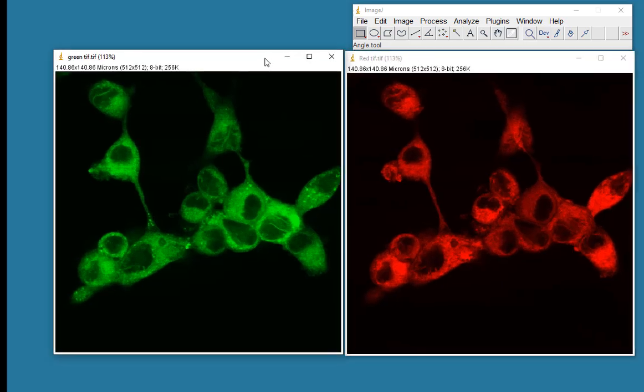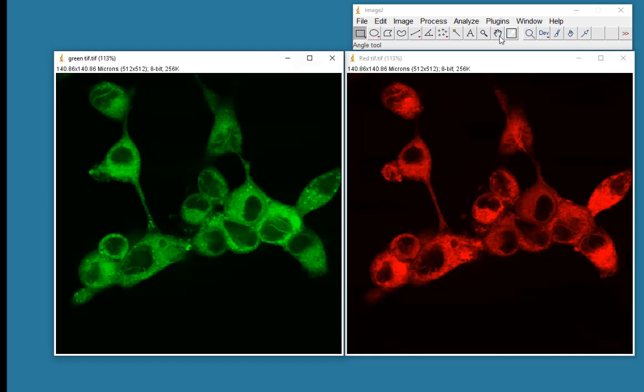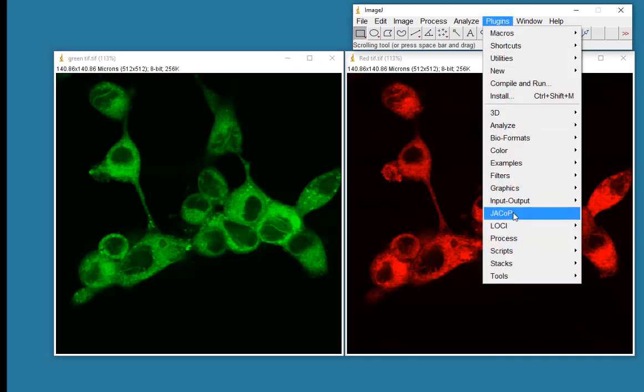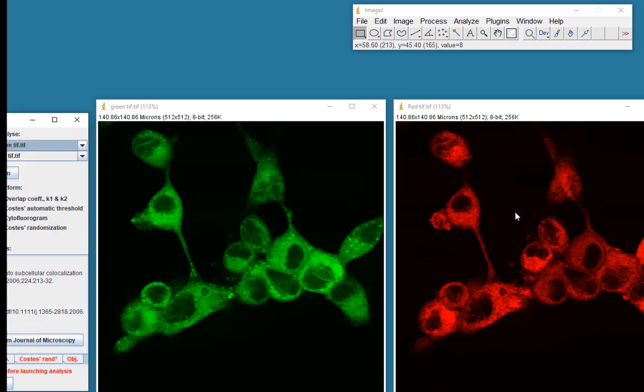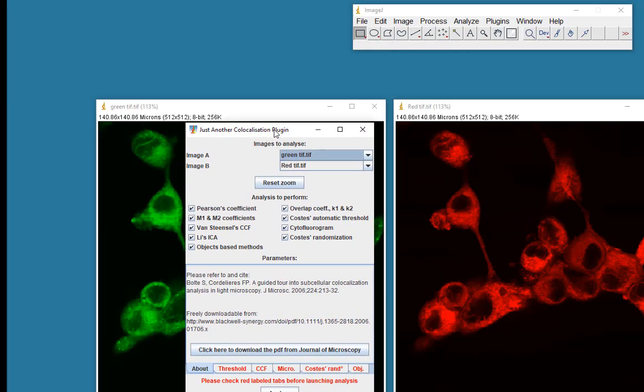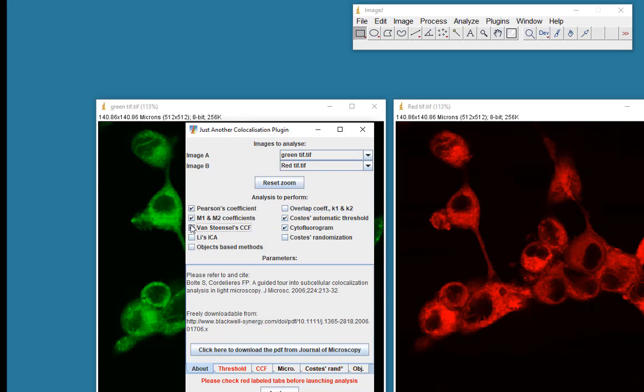What I'm going to use is a plug-in called JACoP, which stands for Just Another Colocalization Plug-in. I suppose the creators of the plug-in thought that was quite humorous. So here's the information that we need to give the JACoP. There's a lot of options here, and I'm really only going to choose the Costes' threshold, the cytofluorogram. I'll maybe come back and do these other ones, but for the moment I just want the Pearson's and the Manders' coefficients.